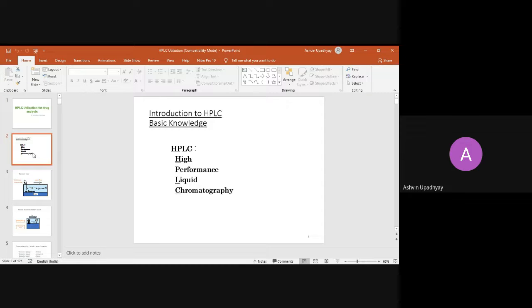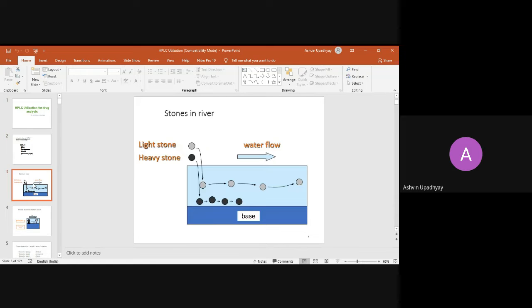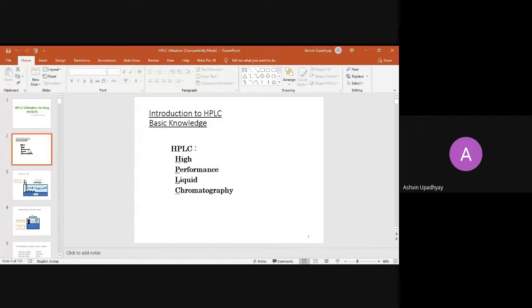First year, the sessions like what is the HPLC system, what are the basics. HPLC is high performance liquid chromatography. I move forward, fast forward, for this technology of HPLC. So HPLC is called high performance liquid chromatography as well as high pressure chromatography because it sustains 400 bar back pressure created through the different types of columns.